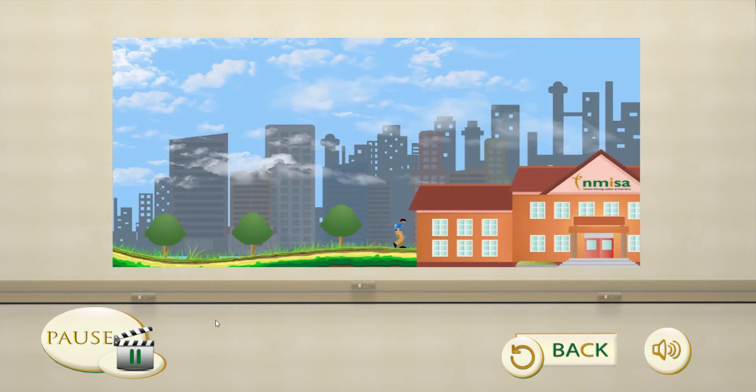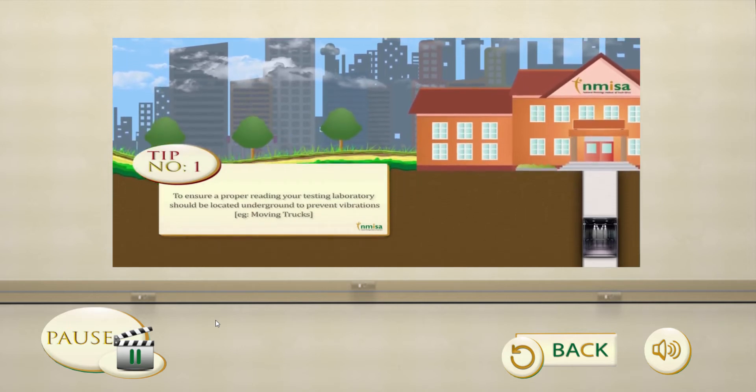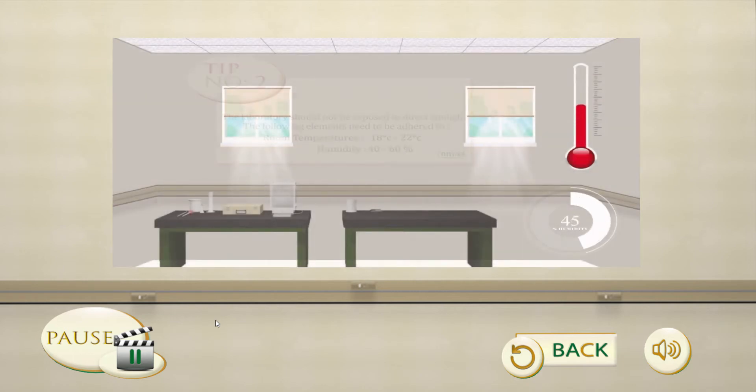Tip 1: To ensure a proper reading, your testing laboratory should be located underground to prevent vibrations. Tip 2: The laboratory should not be exposed to direct sunlight.